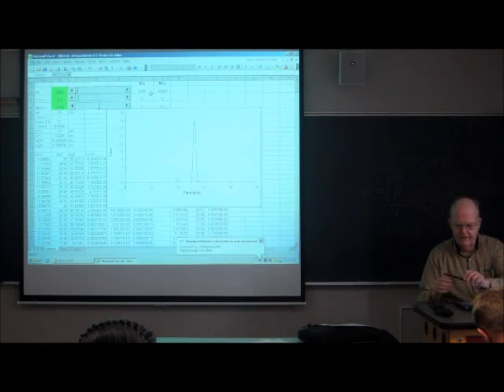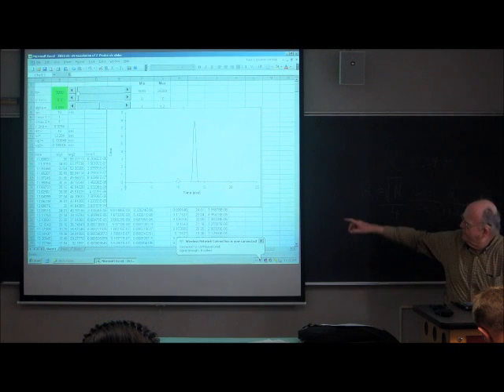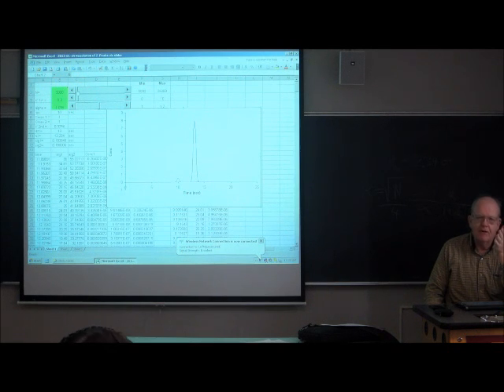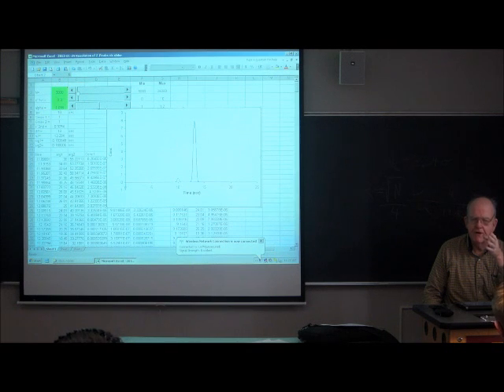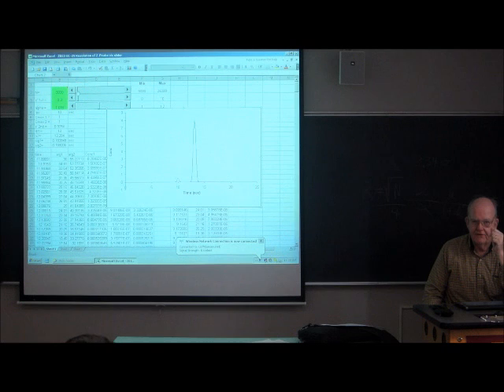First, we'll vary the plate count. Oh, by the way, the little purple peak is a peak that I put at the dead volume of the column, the dead time of the column. So for instance, in GC, you put a little methane or propane in your sample, and that'll show up pretty much unretained. At a column temperature of 50 degrees centigrade, they're just not retained, they're gases. Or it could be an air peak in GC.